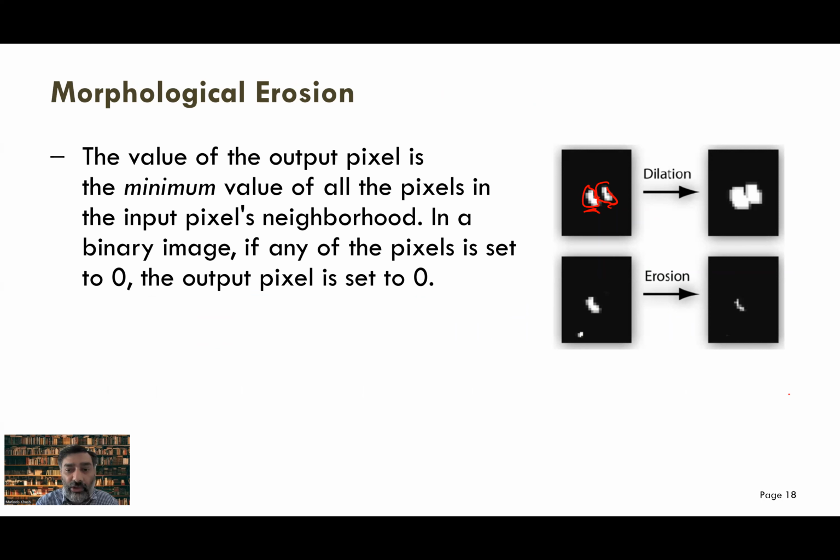And if it's an erosion process, here you see you have two objects. Now you do the erosion. So erosion looks at all the surrounding image, and because the surrounding pixels are zeros, it makes your neighboring pixel 0 as well. So that means the sizes become smaller. This object becomes very, very small, and the object that was already very small is completely gone. So now you use the erosion operation to get rid of the noise. If this was noise, now it's gone from your final image.